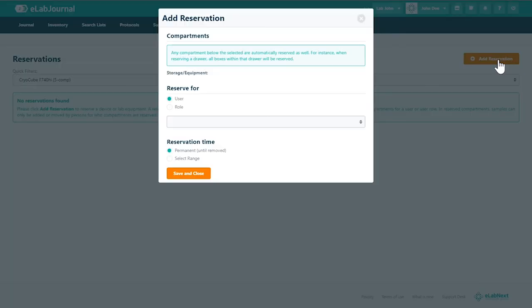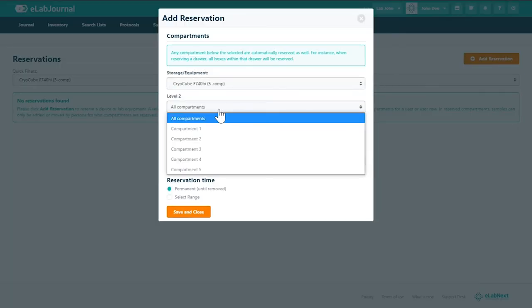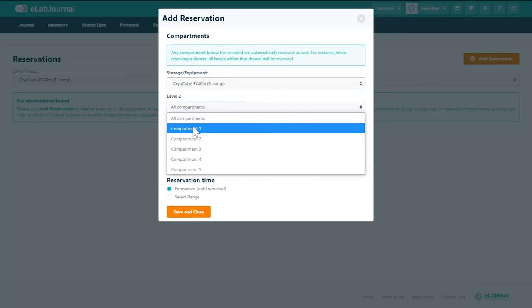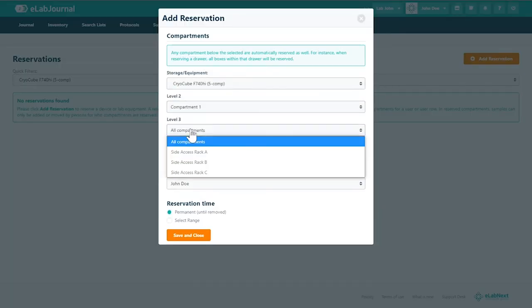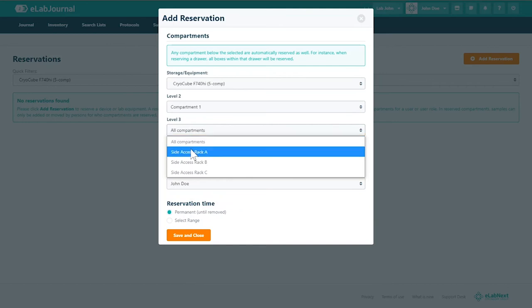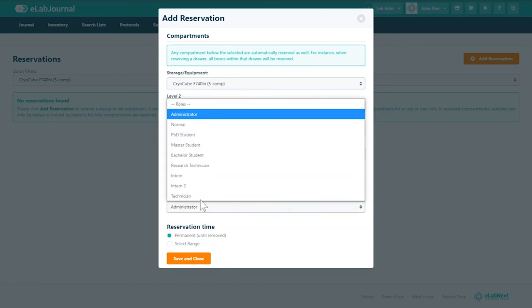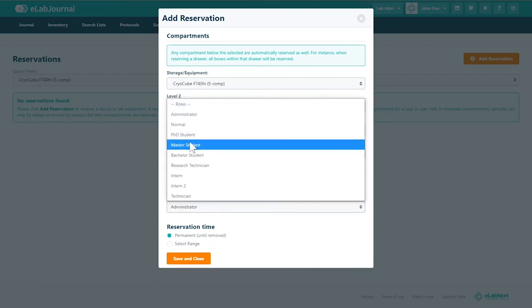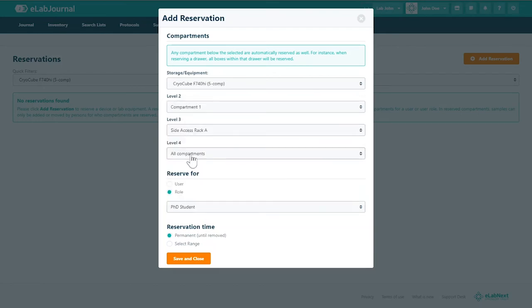To make a reservation click add reservation and fill in the fields provided. You will need to specify the location, the individual reserving and the reservation time. Note that changes to these features are restricted to those who have been assigned permission.